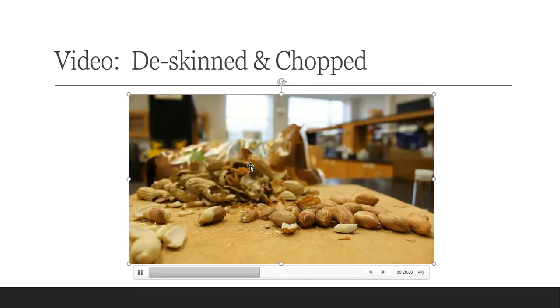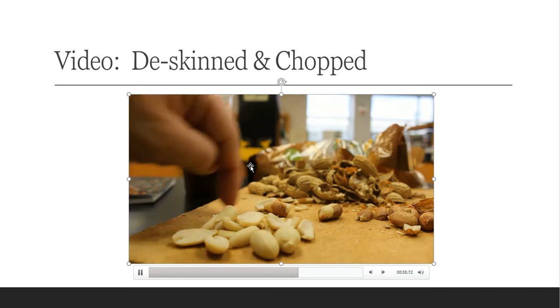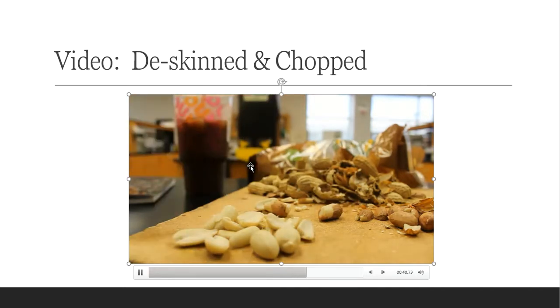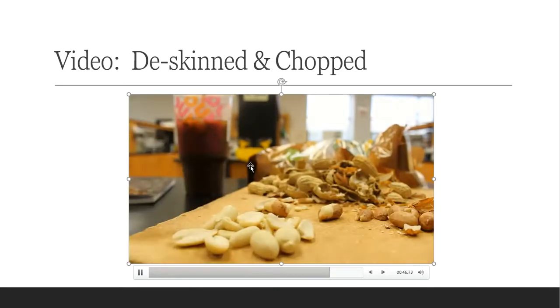I throw the skins away, and then over here on this side, you're going to see not only my Dunkin' Donuts cup in the back, which is a no-no in a lab, but it's okay. It's just me, and it's just peanuts. But here in this pile, that is where my good peanuts are going to go that I'm going to then chop, chop, chop, chop, chop. Over this process, it's going to take me about 30 minutes, I guess, before I can get these prepped, and you'll see how much we weigh out in the very end.